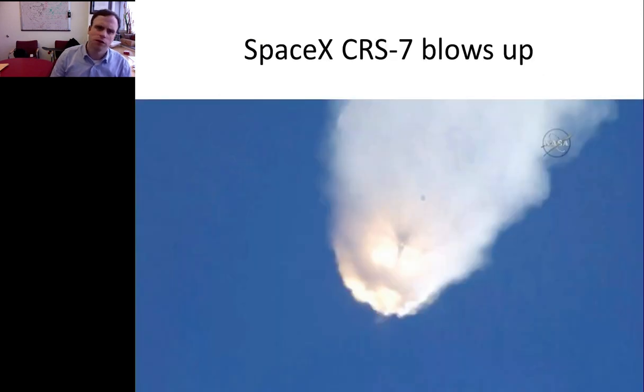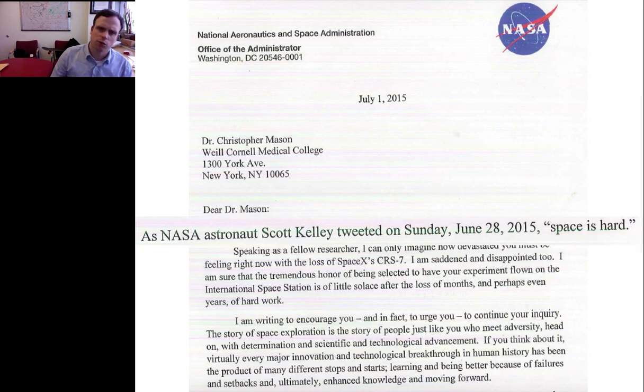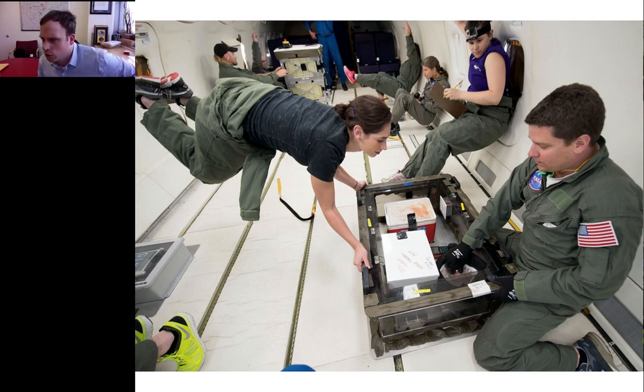So we got this really nice letter saying, sorry that we blew up your supplies, and we're going to urge you to continue your inquiry and make sure that we get more supplies up there, which I thought was very touching, actually. And as we had a chance to do work on the parabolic flight simulator, we could actually see, would the nanopore sequencing work in zero gravity?